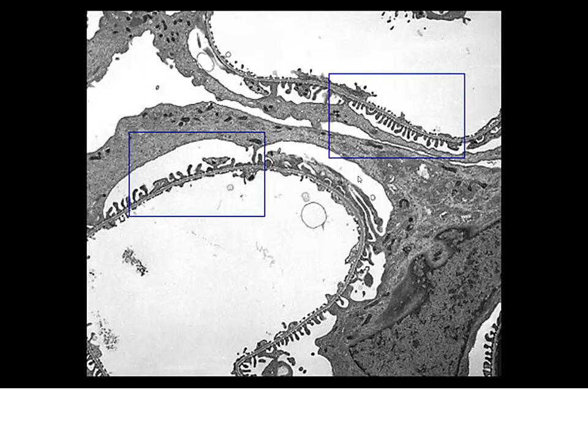Now, looking at that relationship between our podocytes and the endothelial cells, here we're shifting to electron microscopy. On the inside, this is our capillary loop. On the inside, we're going to have our fenestrated type endothelium, the endothelial capillaries here. We've got our basement membrane. Remember, 2 lamina rarae with a lamina densa between.